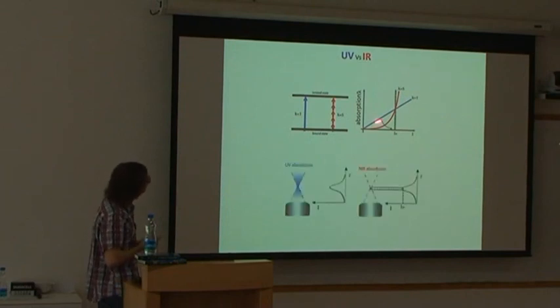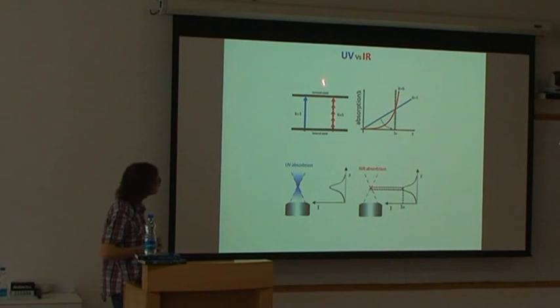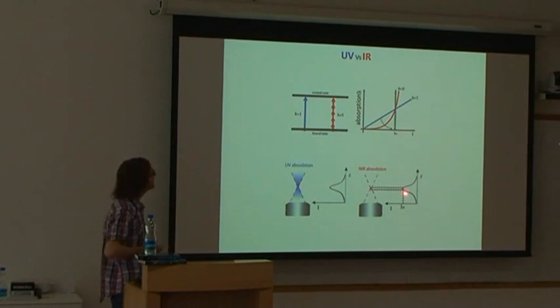In this case, with the UV, if you have a uniform absorption, what you will have is that when you send the UV on your specimen, not only will the UV be absorbed at the focal point, but also much before and probably also after. If instead you take into account the infrared, you will see that it happens only where you have the maximum intensity, thus where you compact spatially more photons, is where you will reach the threshold and thus dissect. So with infrared, it's much easier to do bulk dissection within tissue. With UV, I think it's more suited for surface dissection. Okay.